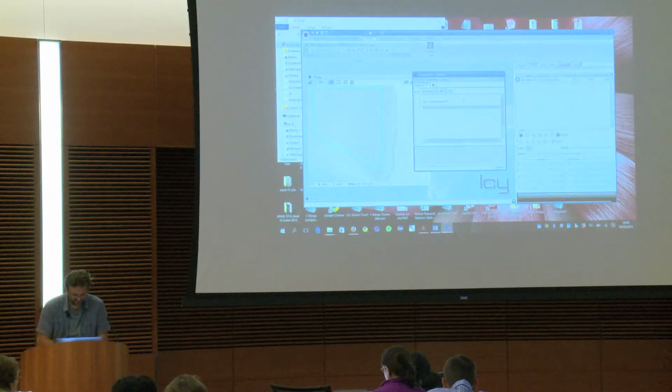And then you want to get the name, type sec dot get name, and you have it. And if you want to print it, you do this, and you see the error here on the left because I didn't put my bracket. And then you press play, and you see ps7.jpg.